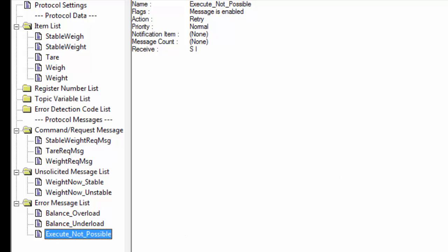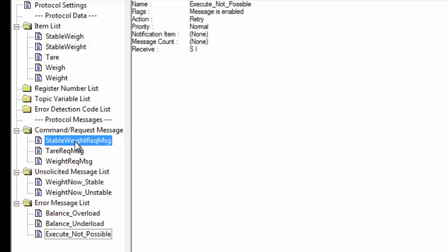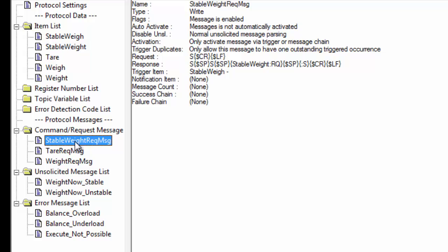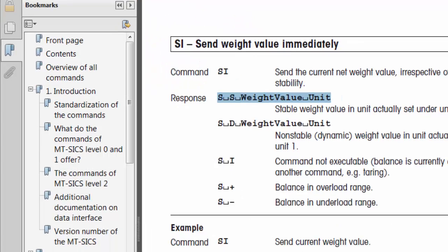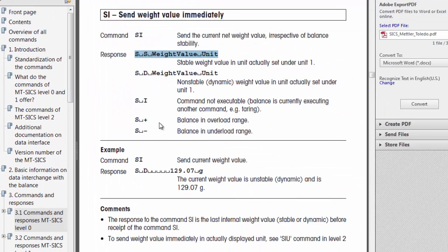That's how that command is implemented. You'll also see we have a stable weight command, which is just the S command you can find in the documentation, and we also have a tare request command. All three are defined — these are the most common commands we see people using with their Mettler-Toledo scales. As I showed you in this document, you can use this starter protocol as a sample to get a start with any of the other commands listed, just using the rules we've discussed today.